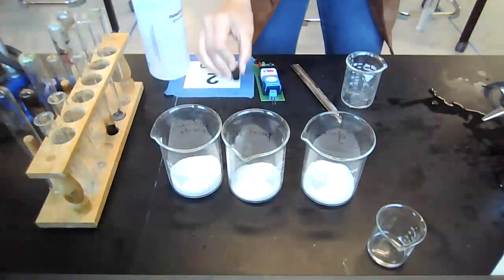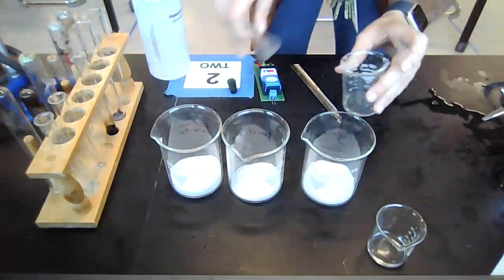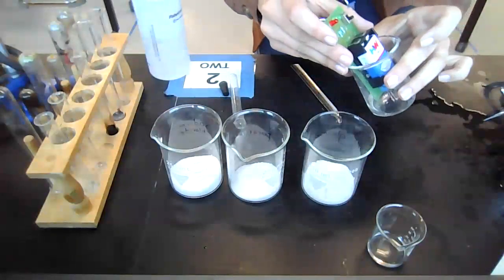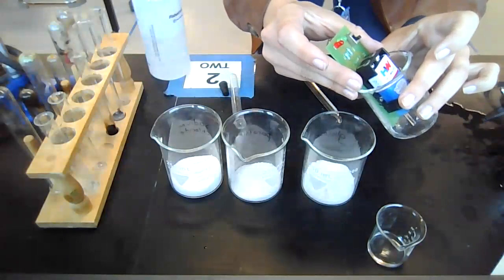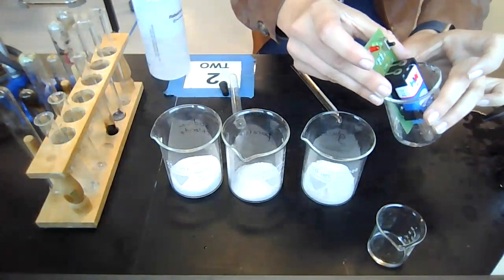Okay, test the conductivity again. We're going to go ahead and pour it in here. And what we can see is that it's a little dim, but it's not really conducting. So that glucose in the water doesn't really conduct.